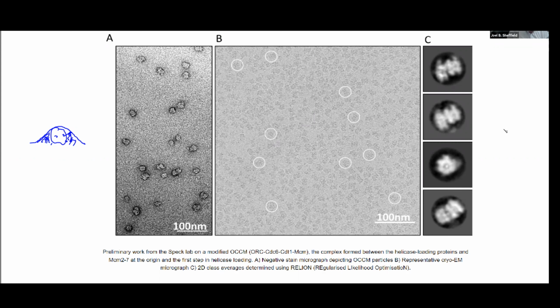And so each one is going to be this sort of vague structure. But what you try to do with them is assemble them into a stack in which their similar images are combined. So the idea is this: if you have some kind, and I'll make it really simple for the moment, if you have a cylindrical sample, and let's say it even has a bar around it, right?